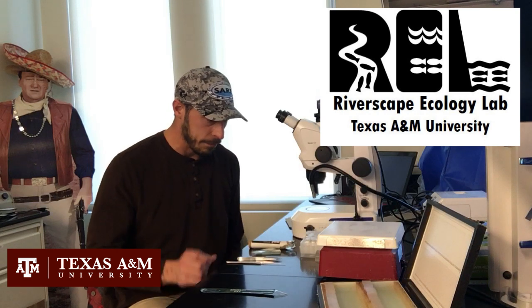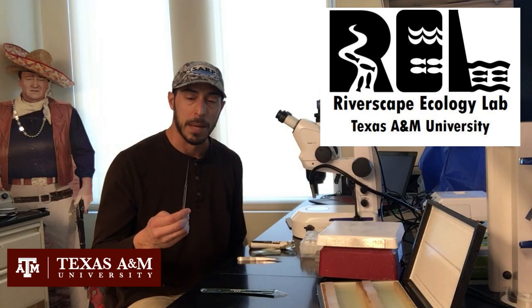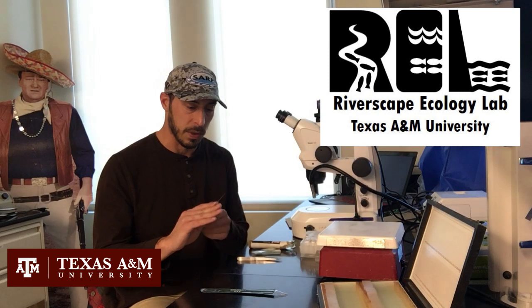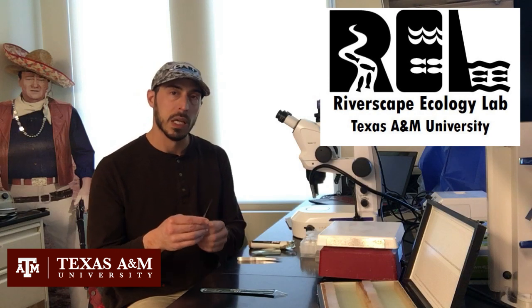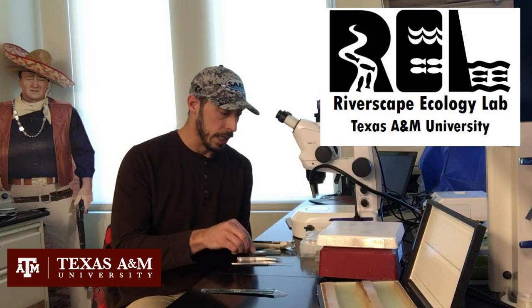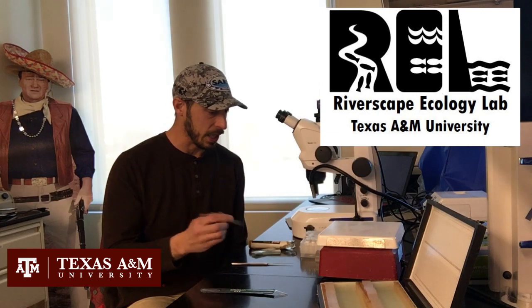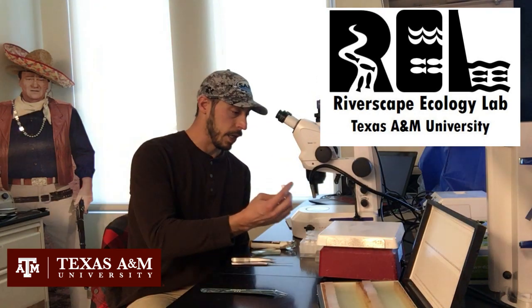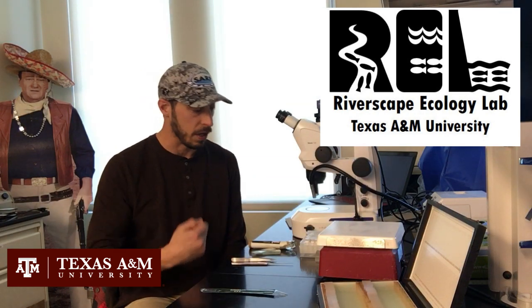So the first things you're going to need are this fine-tip probe. I bought this hooked one originally, but it wasn't very useful, so I kind of bent it out and turned it into a 95 to 120 degree probe. You'll see it under the scope in the recording. And then some fine-tipped forceps as well. I rarely use these, but to get the fish out of the vials, or if there's a big piece of flesh that needs to come off, I'll use them.